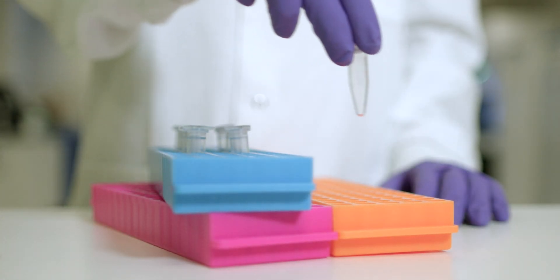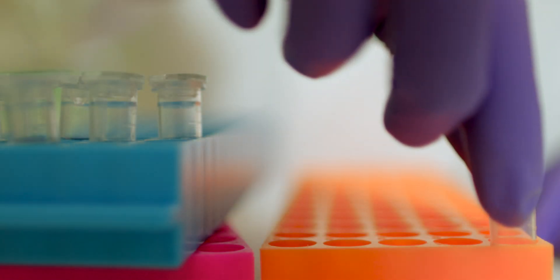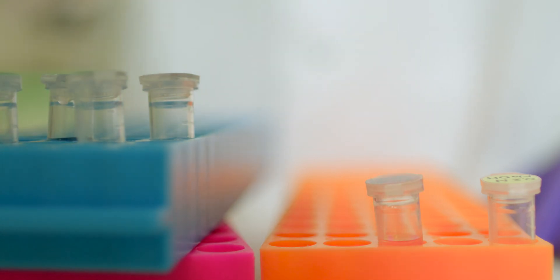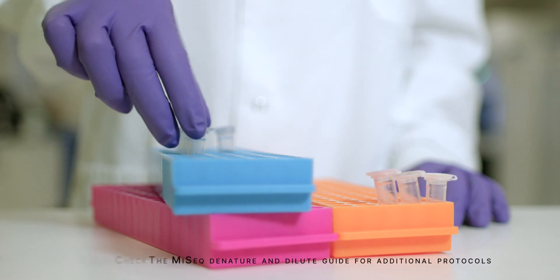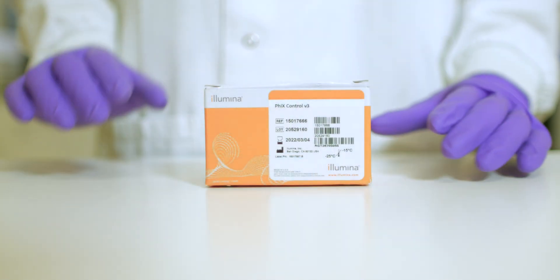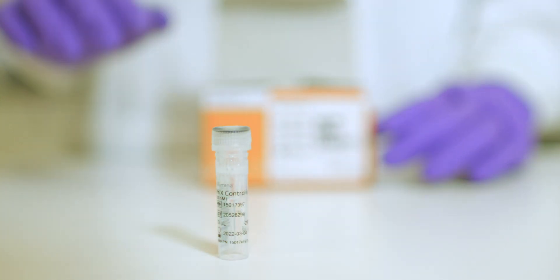In this video we will show you how to denature and dilute prepared libraries for sequencing on the Illumina MiSeq system. During the video we will denature and dilute the libraries for a MiSeq Reagent Kit V3, following the MiSeq Denature and Dilute Guide Protocol A. We will also show you how to prepare and add a PhiX library for use as a sequencing control.